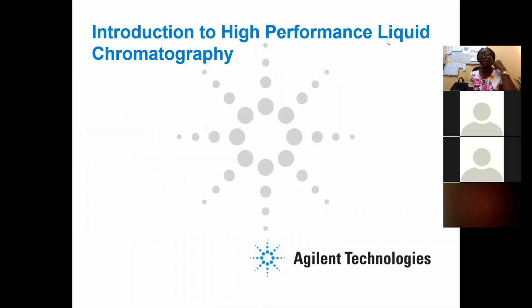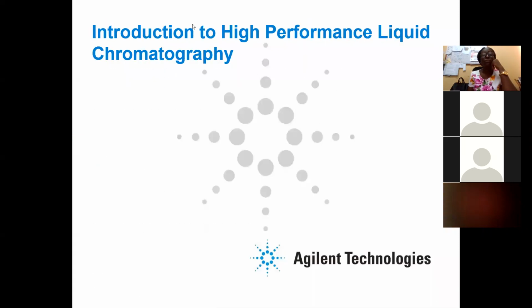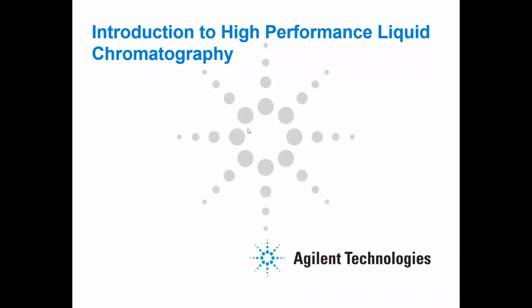I don't know whether I answered that question for you. Yes, you've answered part of it, but can it also be used qualitatively to determine the identity of a particular peak? Yes, you can also use it for qualitative analysis, but that is why we have our detectors.